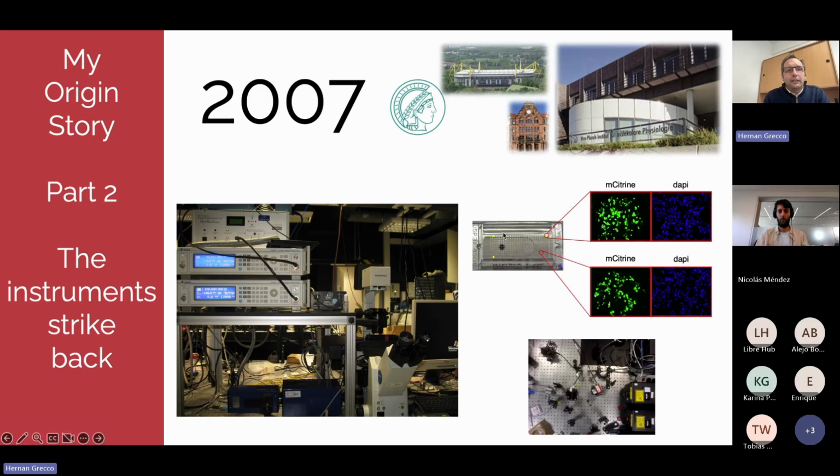So basically, this is a lab tech chamber, and if you see, there are small spots, like 384 of them. In each you have cells, and you can move from spot to spot and take images. And this was taking just standard images of fluorescence, transmission, fluorescence lifetime images as well. And that process was taking maybe 30 or 40 hours, something like that, right?